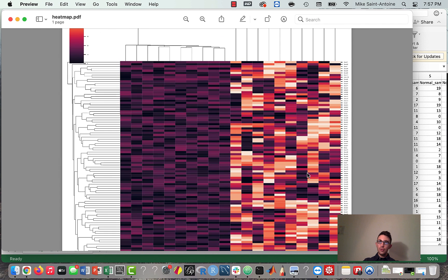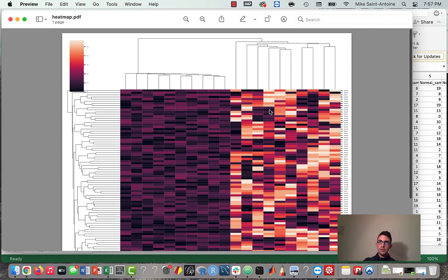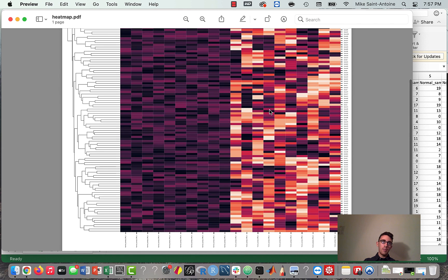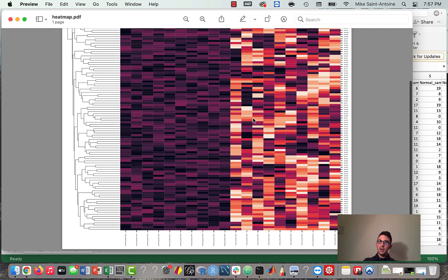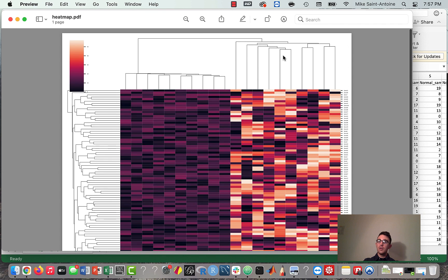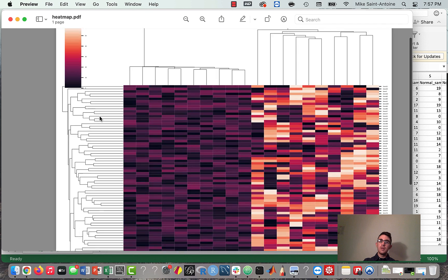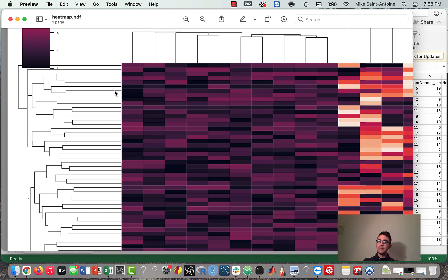The cool thing about these is that you can see how closely the genes are related to each other in terms of expression levels, and also how closely the samples are related to each other in terms of expression levels. You can see these brackets here — these brackets are showing the similarity clustering for all the genes. These ones are actually showing for the samples, because these are the column brackets. And then for the rows, we can see the similarity clustering for the genes too.